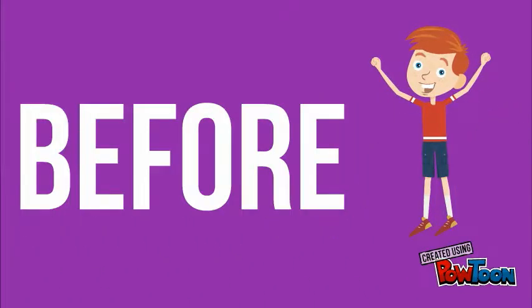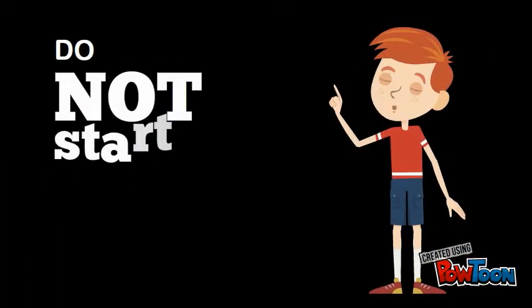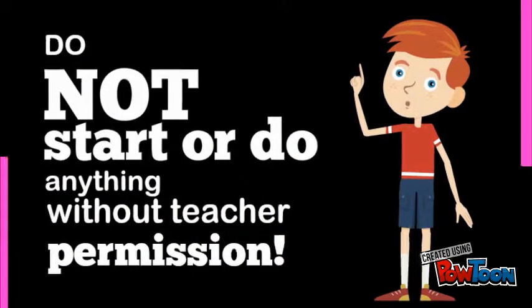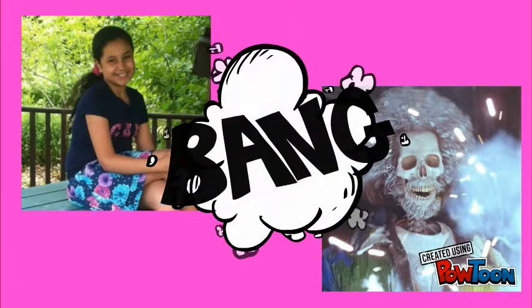To start off, I'm going to give you some rules and regulations for even before you start your procedure or experiment. Firstly, do not start or do anything without teacher permission. For example, if you were told not to turn on that switch, please just don't turn on that switch, because everyone knows this can happen in the snap of a finger.